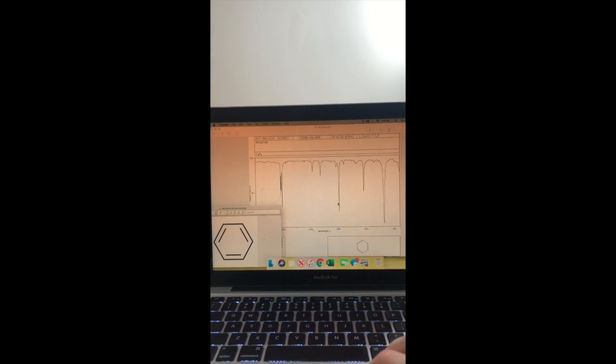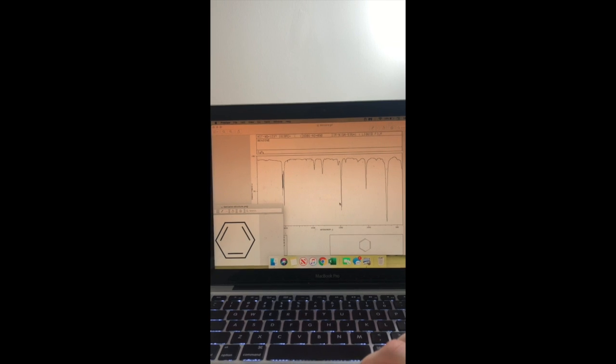The biggest takeaway from benzene are these small, seemingly insignificant peaks around 2000 wave number, known as the aryl overtones. This is a critical feature of this spectrum in all benzene-inclusive molecules, as they indicate the presence of that ring structure. Additionally, a strong peak at 1500 wave number is also observed here, which is illustrative of an aromatic carbon-carbon double bond. Finally, this last molecule is known as benzonitrile, a benzene ring with a nitrile substituent.